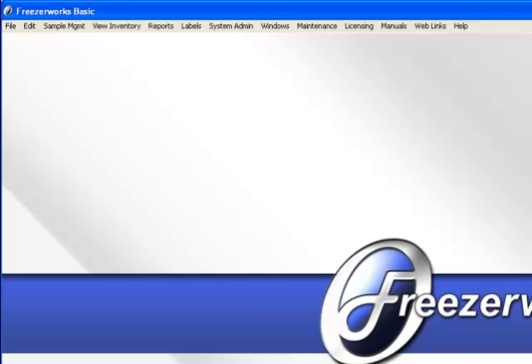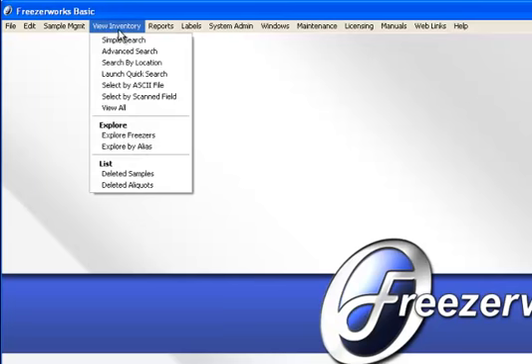So this is what I do then. So with Clip, I quickly enter and I quickly locate, and I keep things straight that way. Now in order to delete, let's say that the week has gone by and it's Thursday again. First thing I'm going to want to do when I come in the morning is delete Thursday samples. I'm going to remove them from the refrigerator.